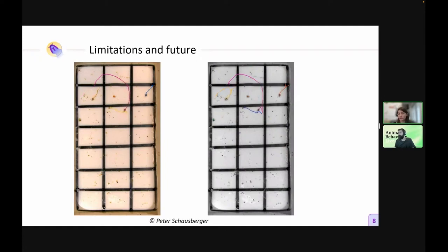It would be super interesting, but to do that you need another level. Usually you need artificial intelligence. And it also means that it's not that generalistic, because the head of a mouse is not the same as the head of an ant. So it would be very different and much more complex, I guess.